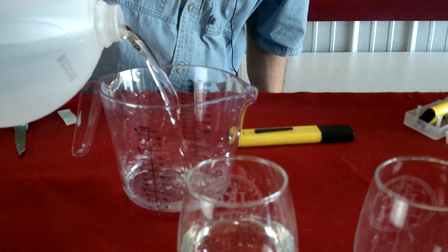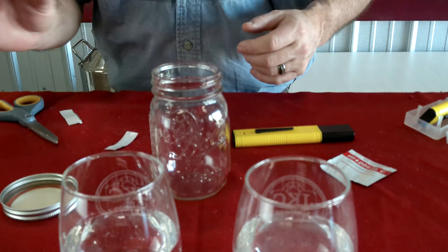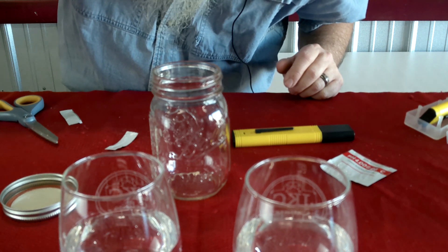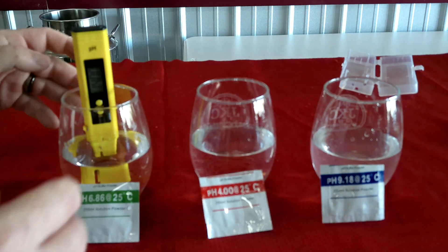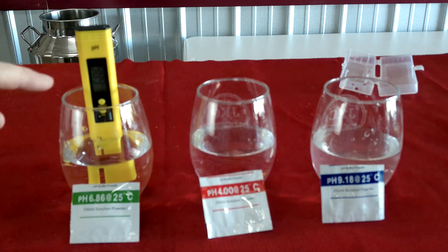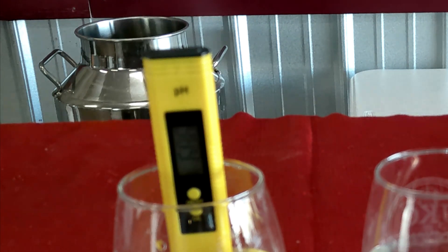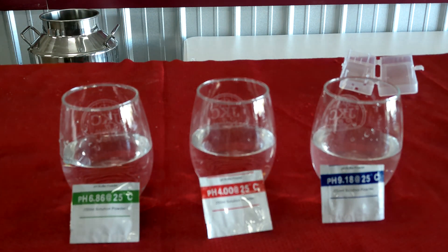I'm going to do another 250 milliliters and mix up the 4.0, and then another 250 milliliters and mix up the 9.18. Now we're going to turn the pH meter on, submerge it into the 6.86 solution, and hold down the calibration button for five seconds, then let it go. It reads 6.86 and then starts flashing — you leave it in there until it stops flashing. Now the pH meter knows what 6.86 looks like.